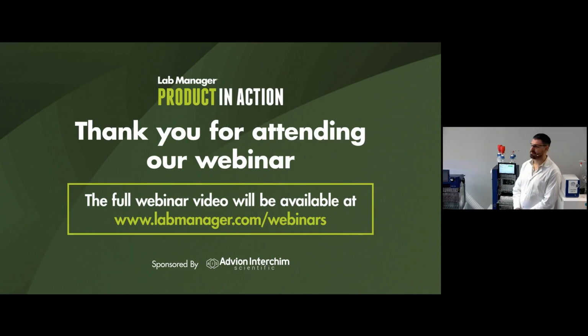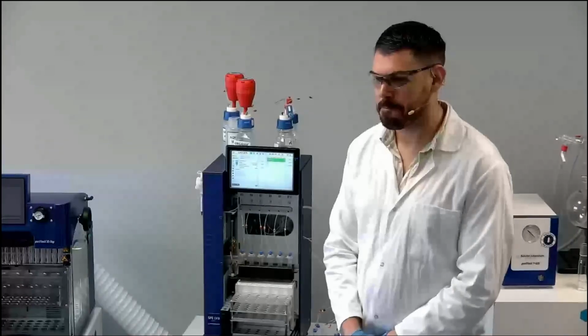It says, is there any specific washing procedure between sample sets extracted? No, we don't have a specific one, because you have the possibility to select and create your washing step depending on the sample. That's why you have a lot of flexibility with the software to select the sample that you want to use to clean your sample lines, for example, if you want to start another run with the next sample. Okay, great.